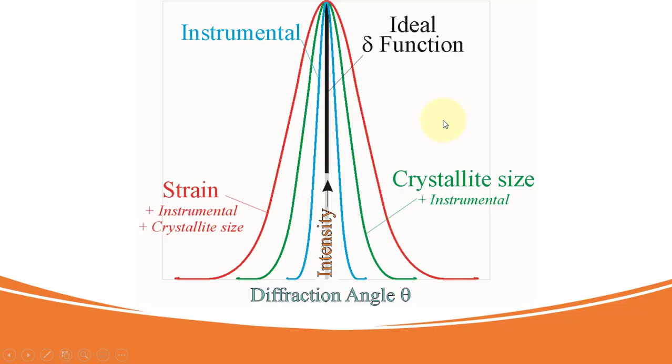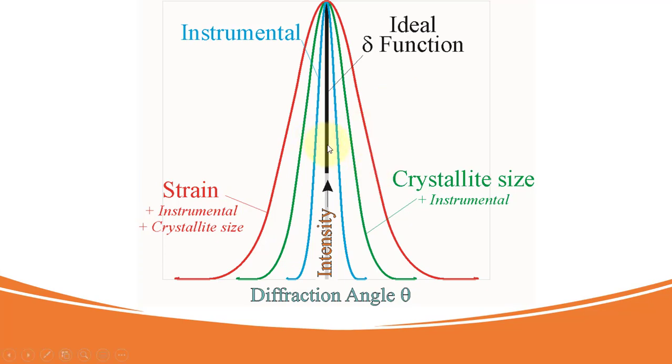To get the actual broadening due to the sample, we will have to subtract the broadening caused by the instrument which can be done with the help of measurement of some standards. Here we can see the magnitudes of contribution to the peak broadening from the instrument as well as from the sample.